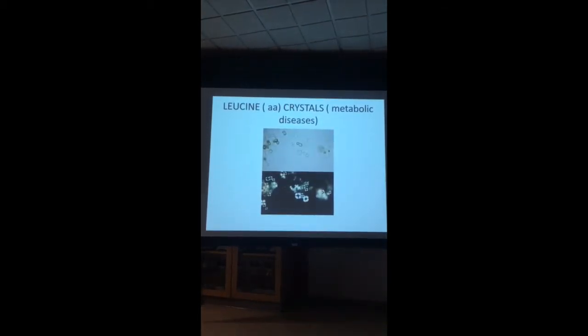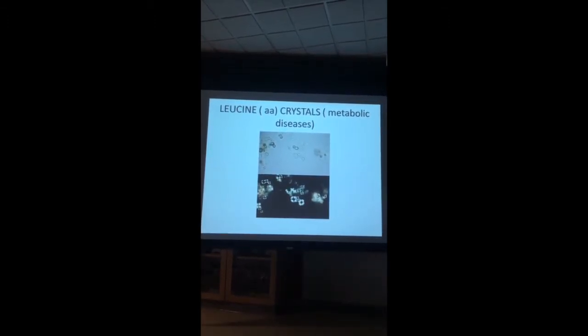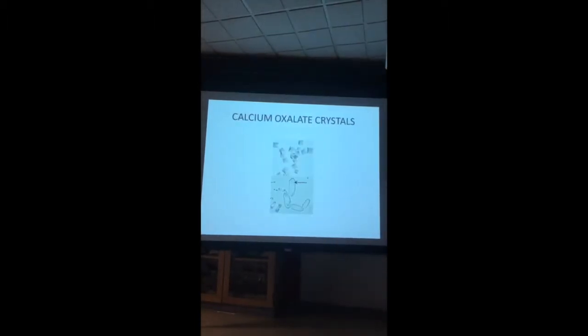Okay, these are leucine crystals. They're just using different types of microscopy here, and that's why these things tend to glow, and it's very hard to see. Leucine. Okay, calcium oxalate. Remember with studs or envelopes.